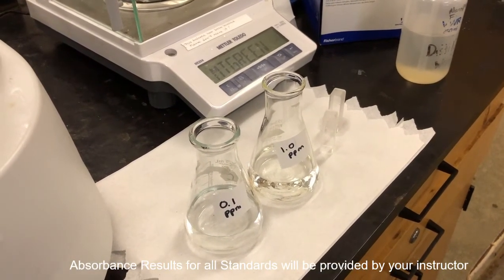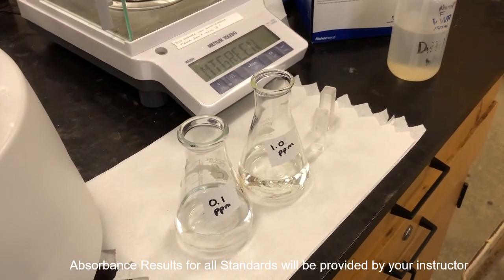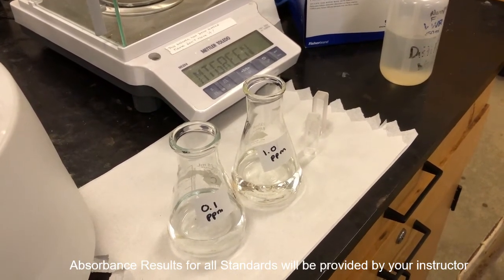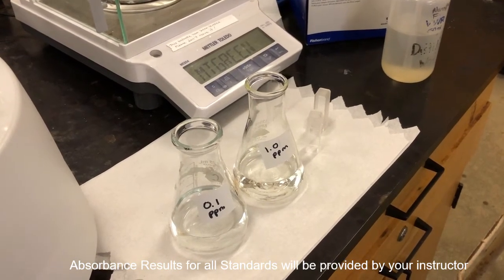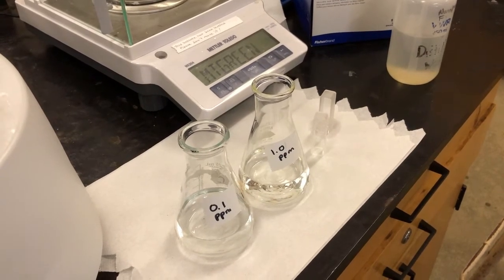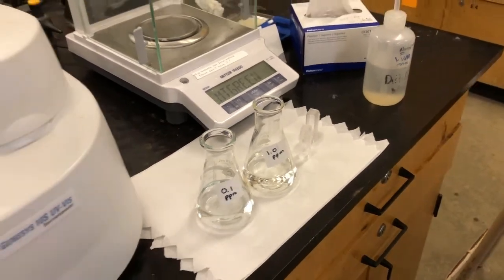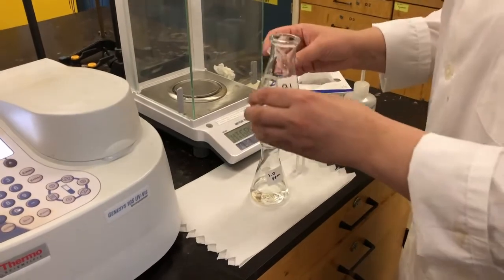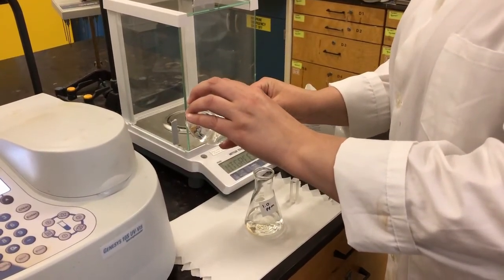Now another thing for this technique is that we have to correct for the interference that may come from dissolved organic matter in the sample. So we're going to do that by measuring the absorbance at 275 nanometers, and if we get any readings at that wavelength, we're going to subtract twice that reading from the reading we get at 220 nanometers. So we'll do that first. We'll start at 275 nanometers. We'll start with the 0.1 ppm sample, and I've already measured a blank, so that's done.